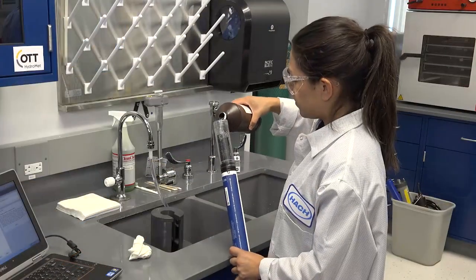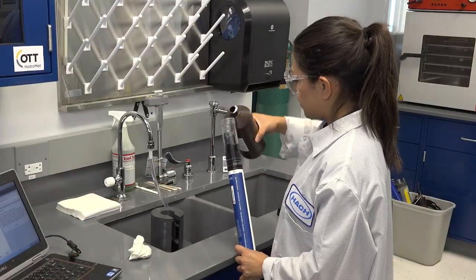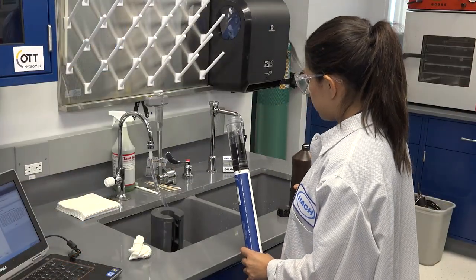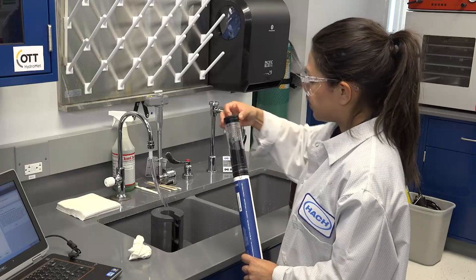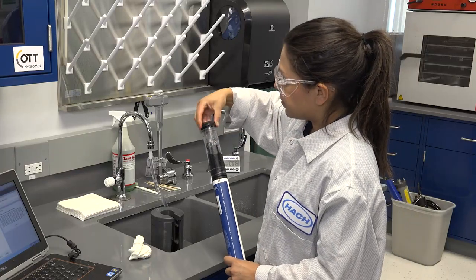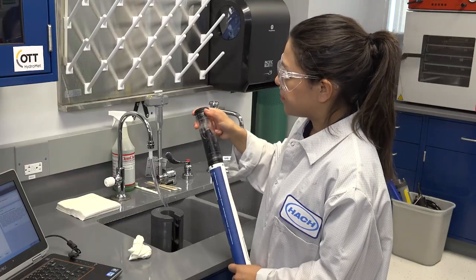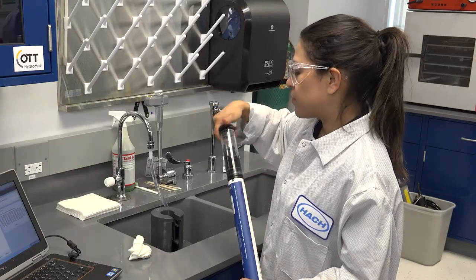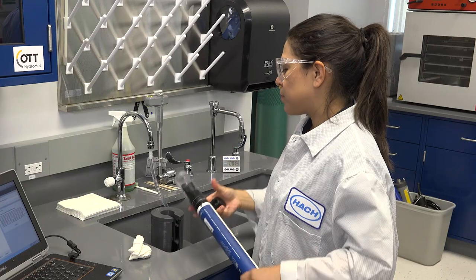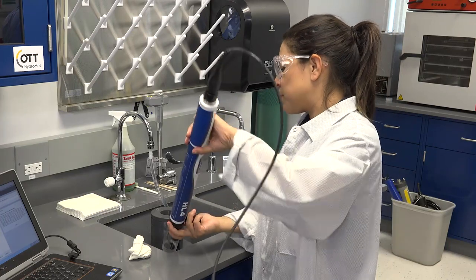Now rinse three times with the desired standard by pouring a small amount of the conductivity standard into the calibration cup, replacing the cap, and shaking vigorously for approximately six seconds.